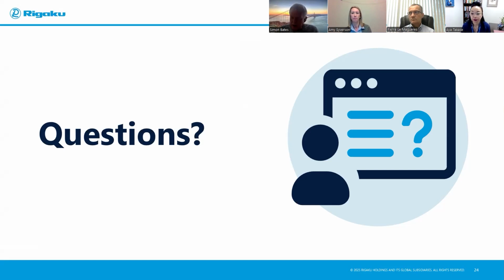That's great, thanks. I was thinking about the last poll question about liquid handling. I'd have thought that having liquid handling would allow you to keep a more accurate track of the stock solution inventory that you have. How do you keep track of the inventory if you don't have any automated liquid handling or something like that? That's where it's just important to document the batches of each solution that you're making, and then try to maintain what is being used. Because even if you're just pouring it out and using it on the lab bench, it's just important to track that. Oh, okay, that's great, thanks.